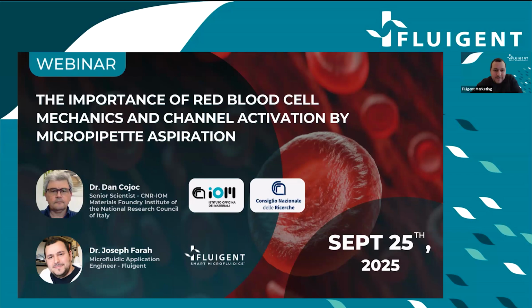Today's webinar will be structured in several parts. First, we will start with a small introduction about cell mechanics and the micropipette aspiration technique. Afterwards, we'll dive into the application with Dr. Dan about red blood cell mechanics and mechanosensitive ion channel activation. And finally, a Q&A session where you can ask your questions directly. So please feel free to use the Q&A box at the bottom of the Zoom part at any time, and we will address your questions after the main presentation.